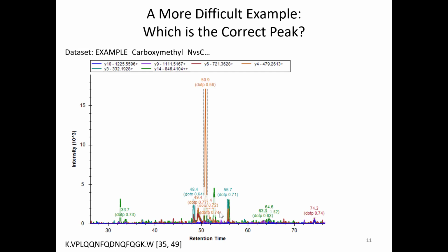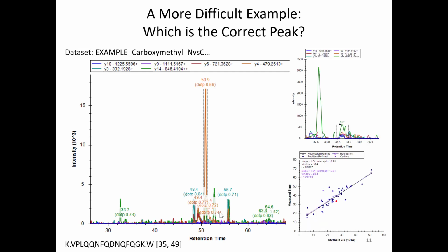What I do when I see something like this is I look at the baseline signal, and anywhere there is a complete liftoff of all the signal for the product ions, I'm going to think, that looks reasonable, because if you choose product ions from a spectral library, it's not often that they are completely unobservable. So one like this where 2 or 3 product ions have absolutely no signal, it's unlikely, in my opinion, that that's the right thing. But it's also trial and error. Some peptides just don't behave.